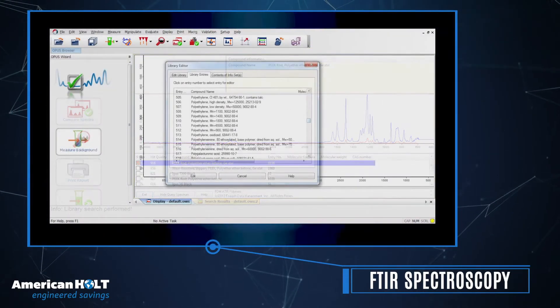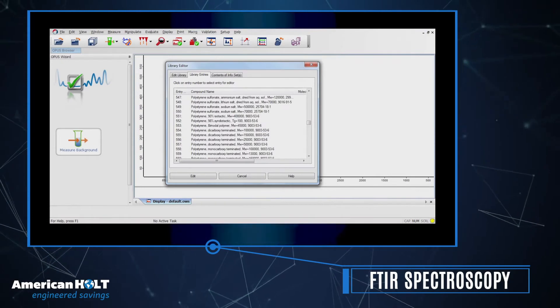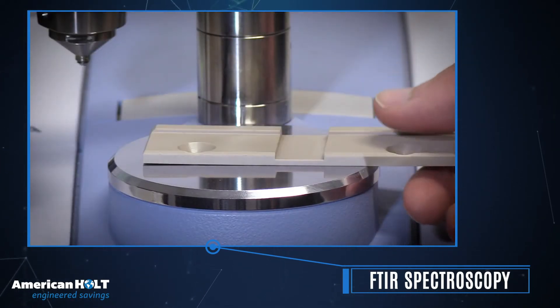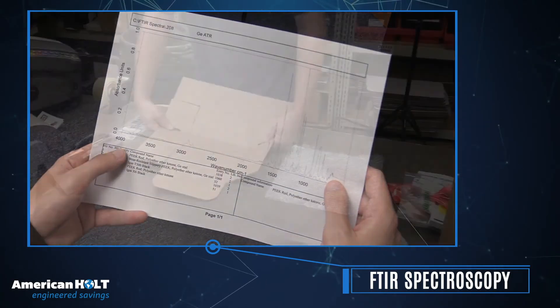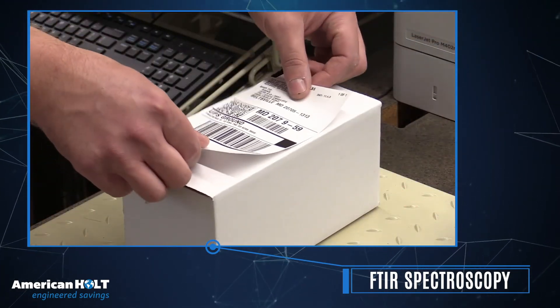This unique energy signature is matched to a corresponding signature in a materials library. Like the XRF, the FTIR is completely non-destructive, and results are fast, meaning that valuable customer-supplied samples can be returned quickly and undamaged.